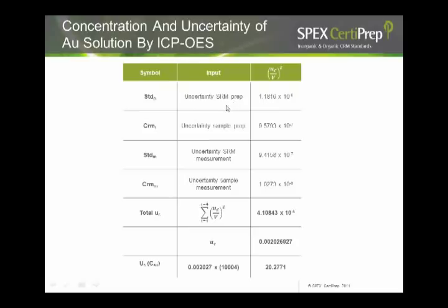The next task is to calculate for the flask. For the flask, we used a 500 ml class A type. So the listed uncertainty was 0.2 ml. The normalization factor, this is triangular, so we use root 6. The value, when you convert it to standard uncertainty for U tolerance, is 0.08165. Now again, this also has the liquid coefficient of expansion component to it. So similar equations used. Here, the volume is 500 ml.